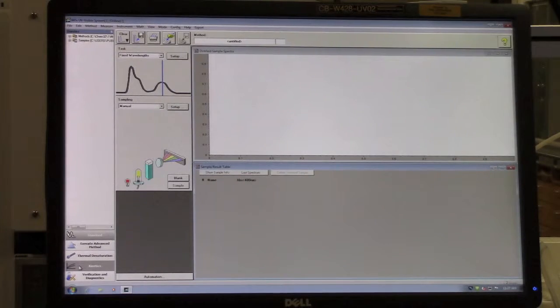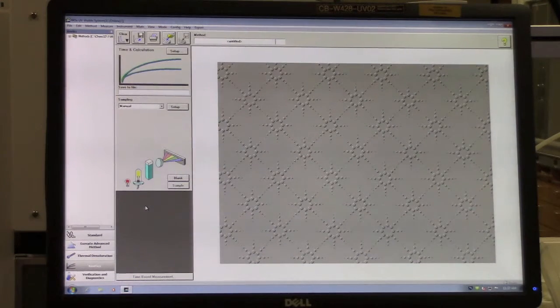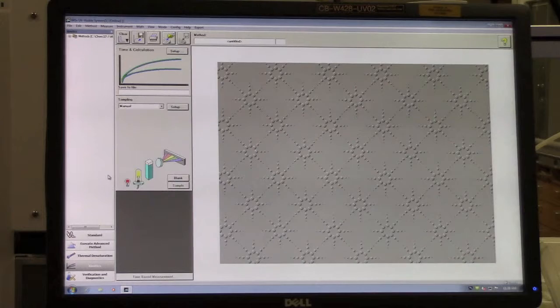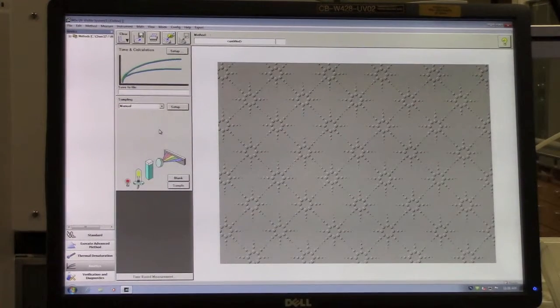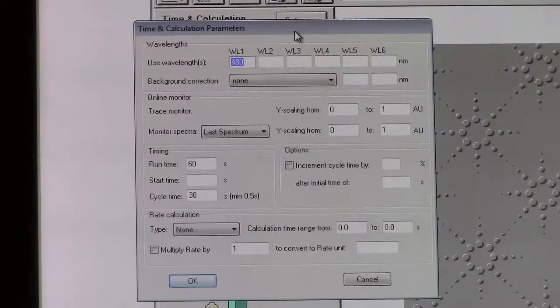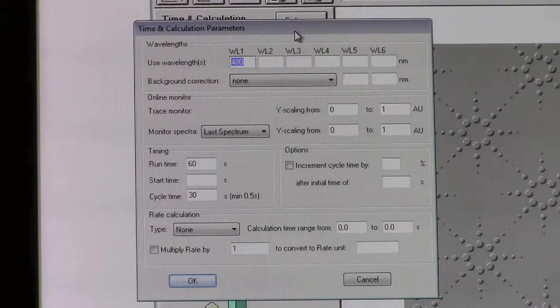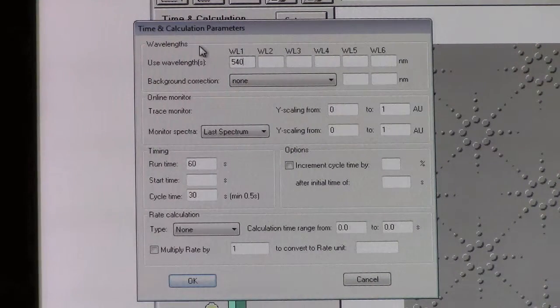At the bottom left corner of the software, you'll see Kinetics. Click on Kinetics and a different mode will load. At this point, make sure you have adequately warmed up the lamps and set both the tungsten and deuterium lamps to the on position. Prior to taking a blank in this mode, set up Time and Calculation at the top of the screen. Once you've opened the Time and Calculation parameters dialog, you can input wavelengths. We'll only need one: 540 nanometers, as listed in your lab manual.